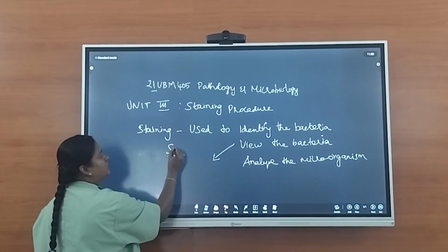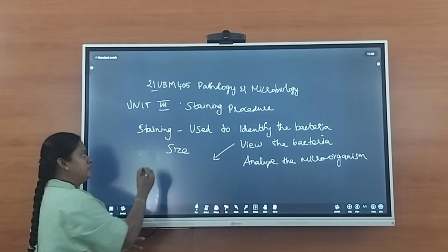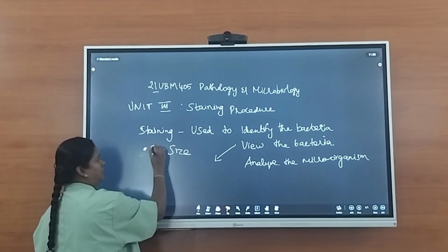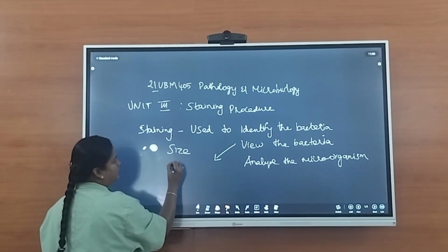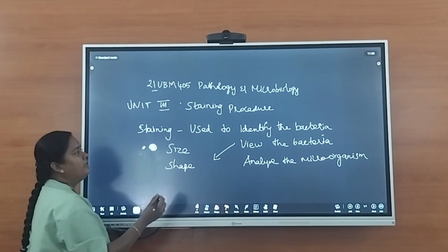The size of the bacteria, whether it is small or big, can be viewed.